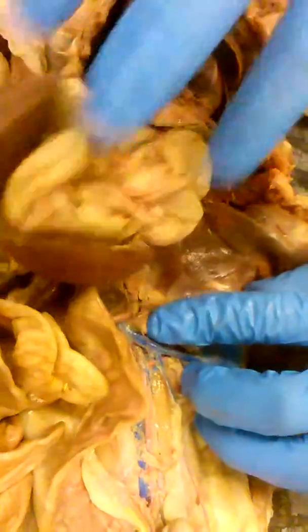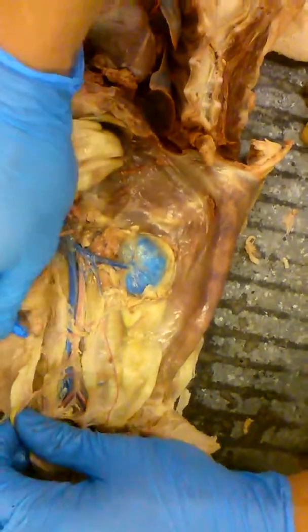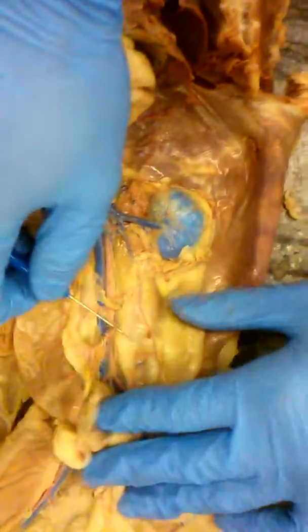Does it have an inferior one? Yep. So celiac trunk is first, then superior mesenteric artery. Then you keep going down, and right here is your inferior mesenteric artery. Oh, so you can see it feeding all the mesenteric. Yep.